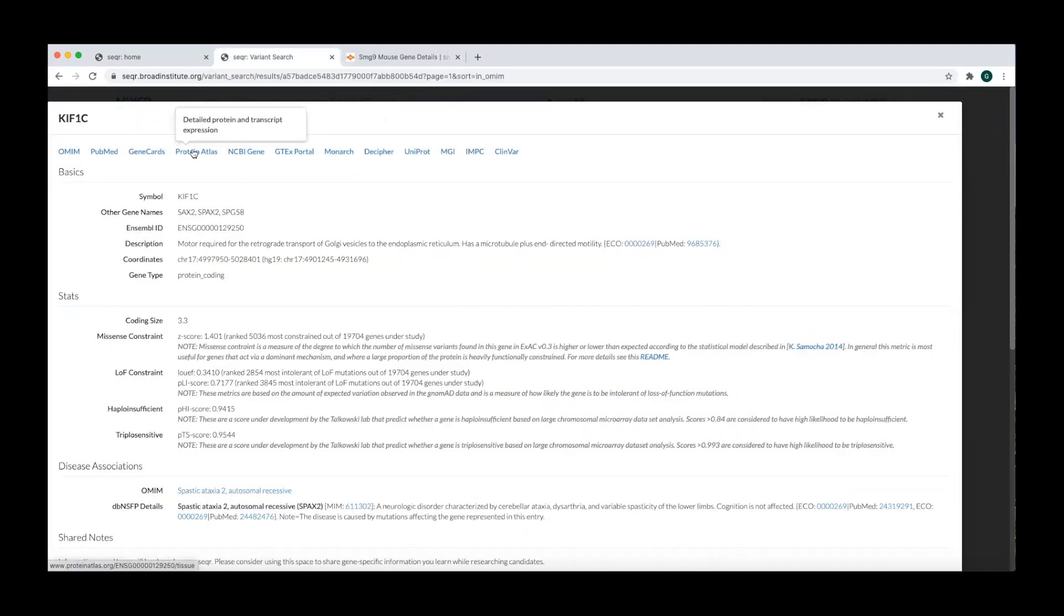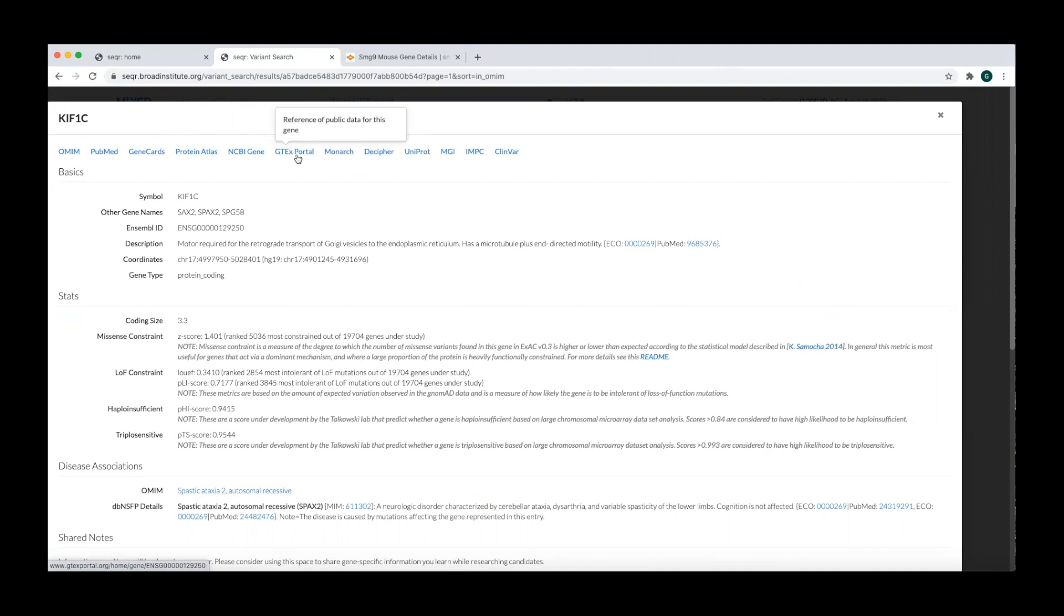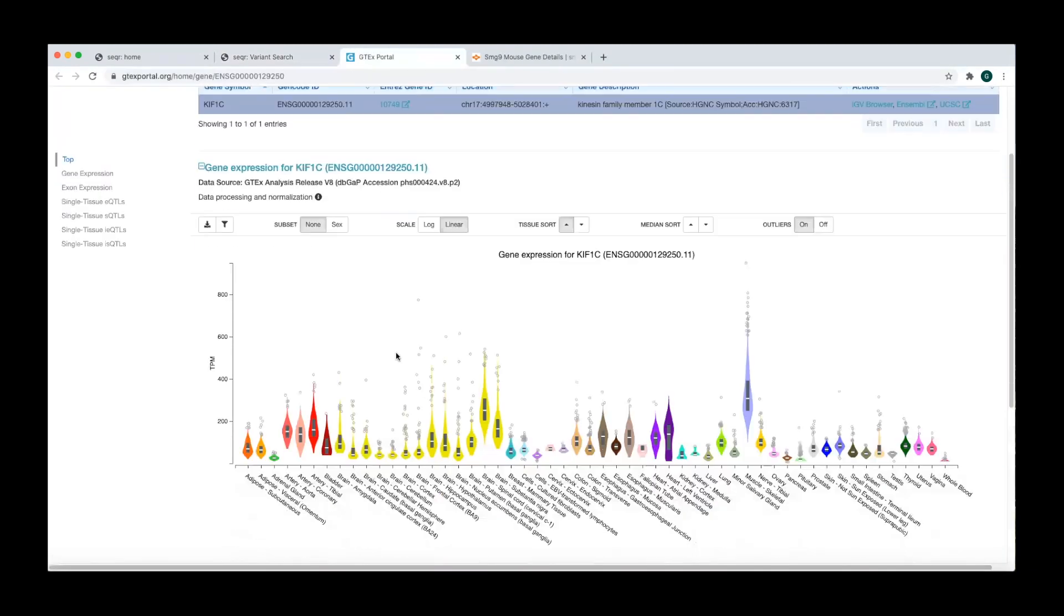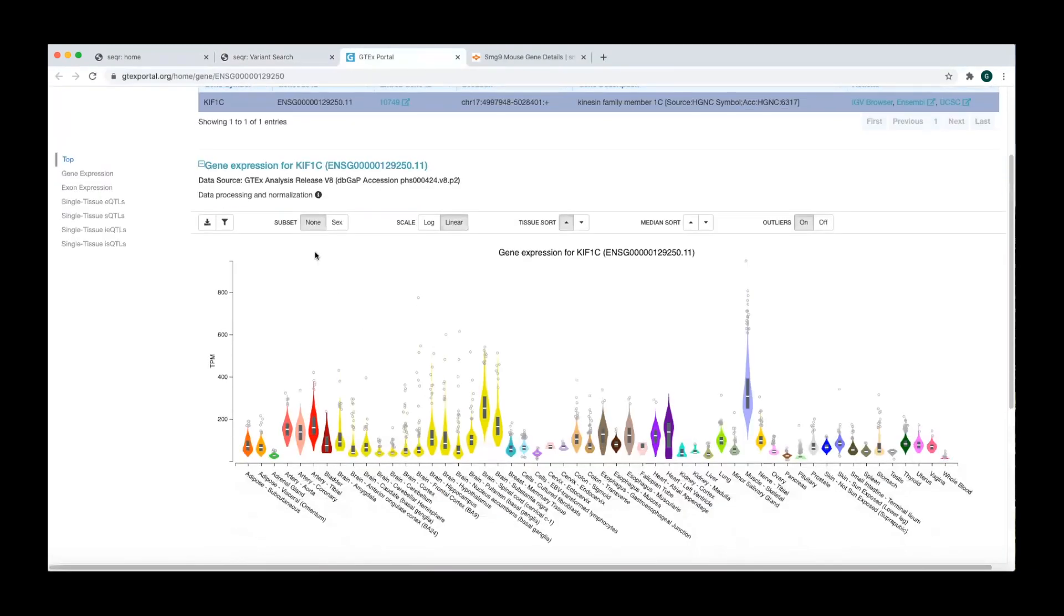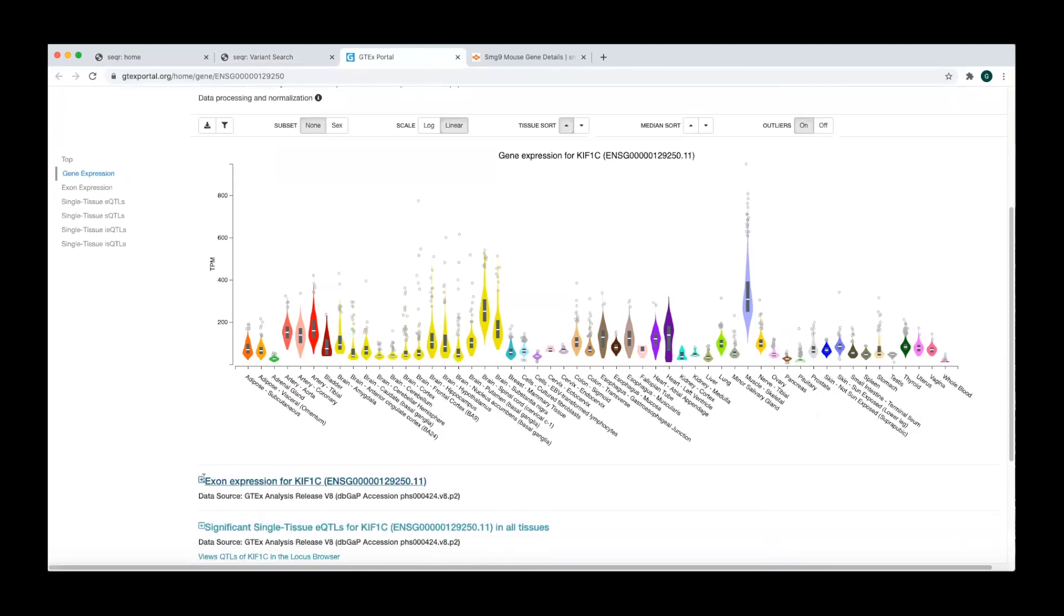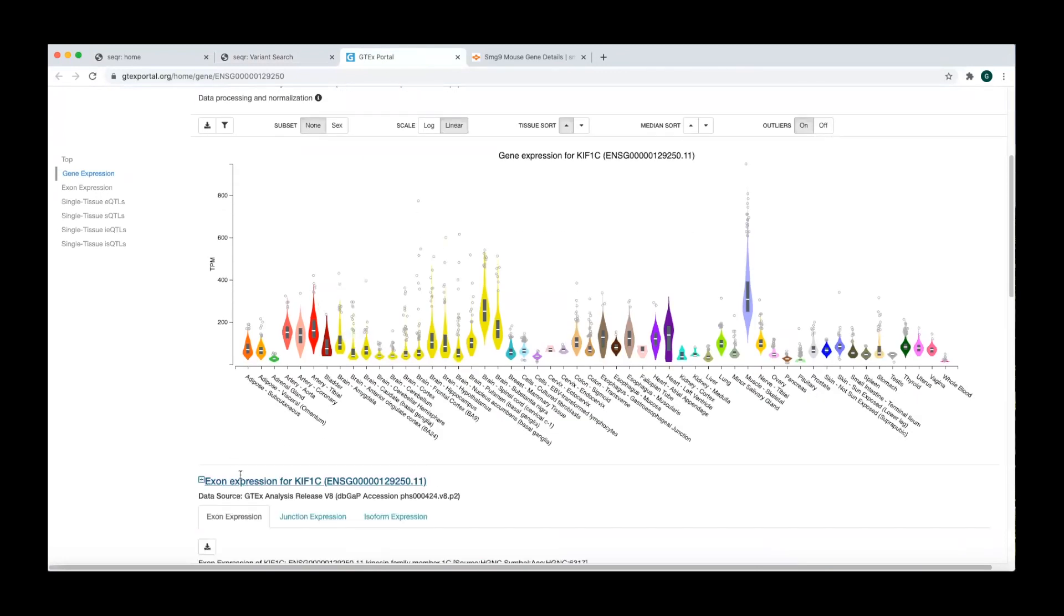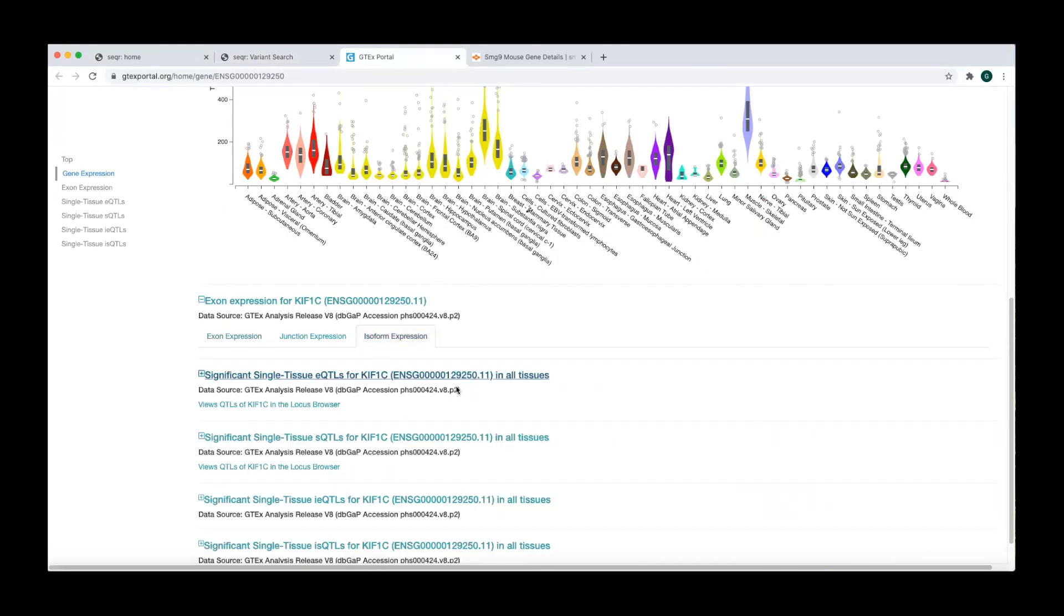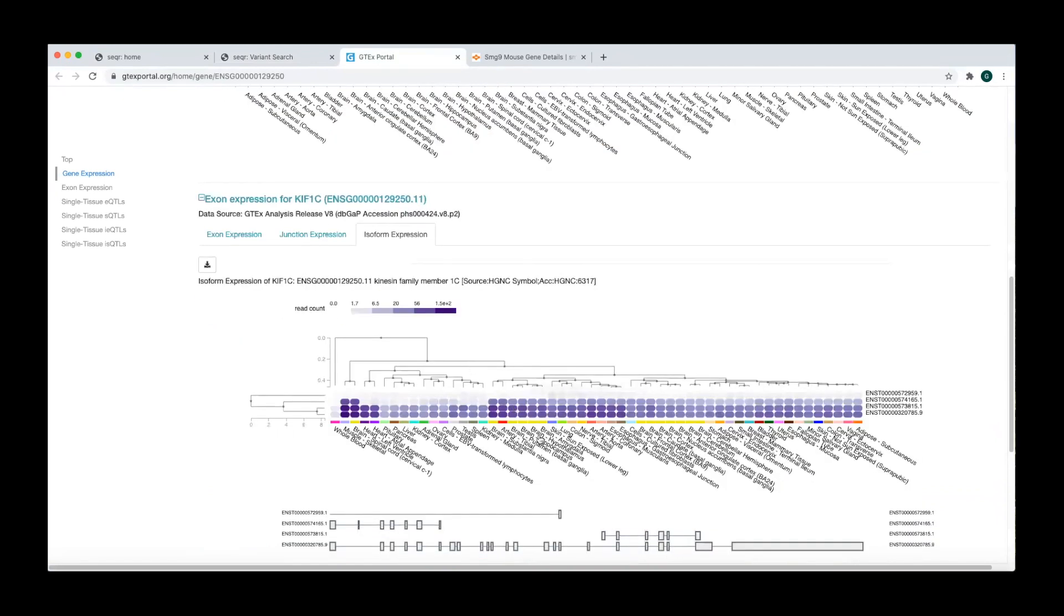The Protein Atlas and GTEx portal contain useful information about transcript and protein expression patterns across tissues. While the GTEx gene expression profile is included in the main gene page, the GTEx portal provides additional information like exon or isoform-specific expression.